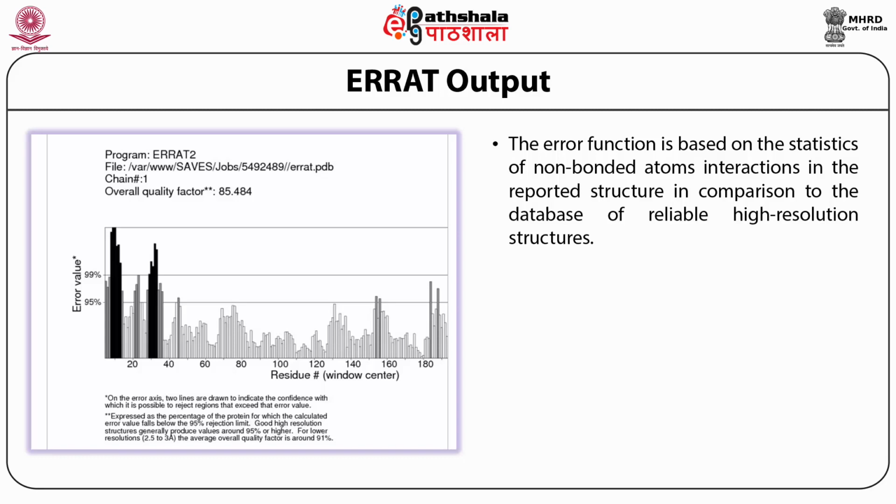The ones in the dark bar regions have very high errors. These amino acids need to be fixed, whether by energy minimization or because the planarity is not good.